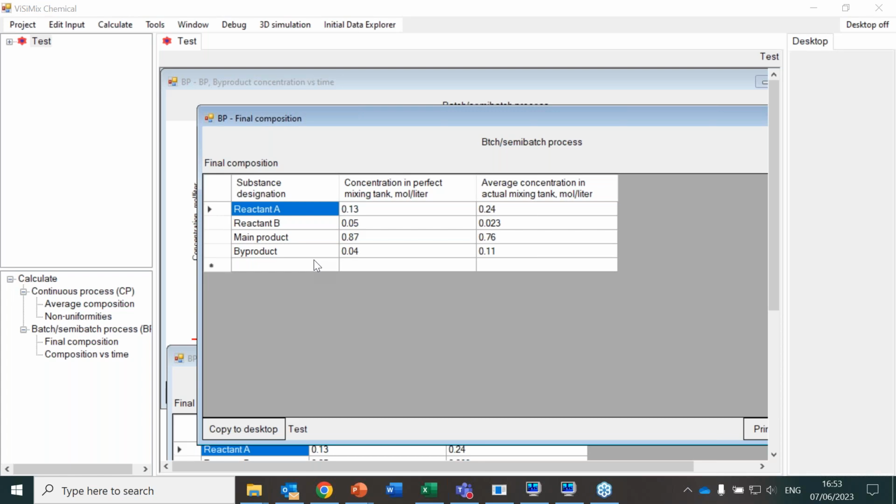Okay? Because those two parameters do not come from the same phenomena, normally we are not able to combine them exactly. But because we now know how the micro mixing time influences the reaction, once we calculate this in the software, we will be able to differentiate the results, because we know the connection to the local mixing, and not only with the macro mixing time. For well-mixed equipment, of course, we will not see any difference. All the equipment will provide the same result, because we are assuming that it is well-mixed.